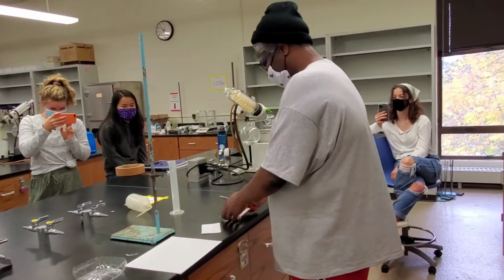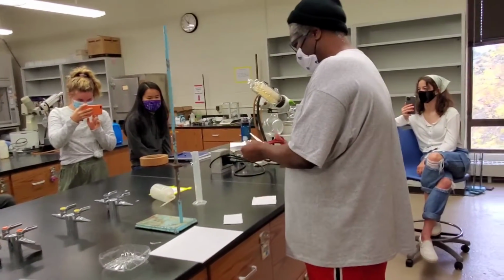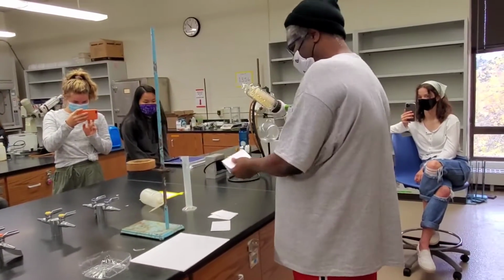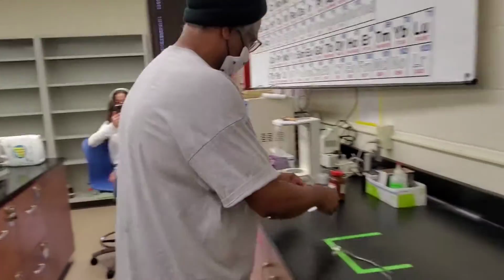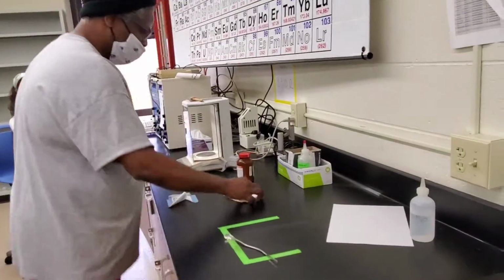What a man. So, and if you don't have anything to do, which is not going to ever happen in this lab, you could always spend time making weighing paper for the rest of the class. Anyway, this is weighing paper, could be made from this, sheets.